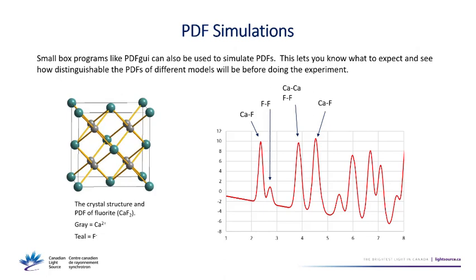Yeah, you can model all the peak sizes. There's something called a shape function. And there are different shape functions for different shapes. The one for a sphere is really easy. That's why they built it right into the program. But there are also shape functions for squares and rectangles and pyramids and all other sorts of stuff. So I think if you dig through, you can find papers which describe those for a lot of them. You could try modeling that yourself for the different shapes. It's just not built into the one program.